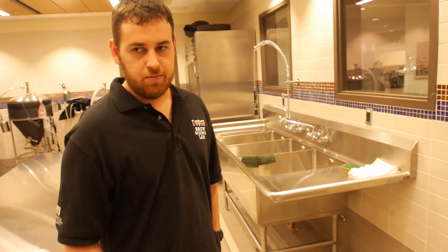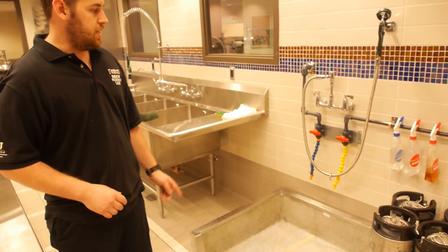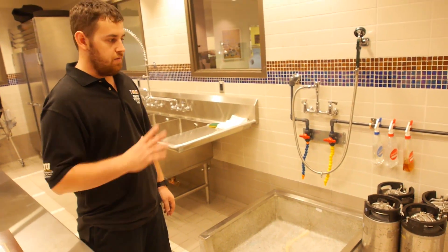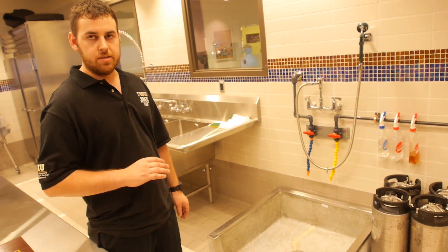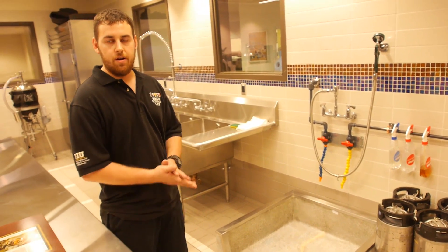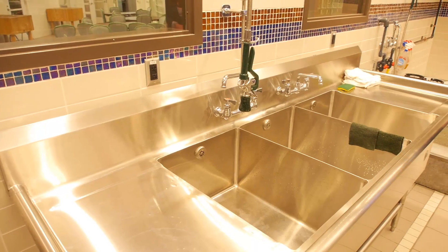Here we have our electrolyzed water system. The yellow is the acid which helps to kill the microbes, and the blue is the alkaline water which helps to clean the kettles. All that's just water and a little bit of salt, so it's really clean and not harsh on your hands or any pot we're using. And then obviously here is our three compartment sink.